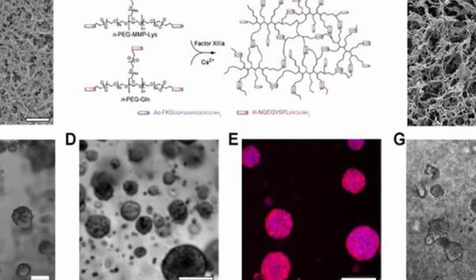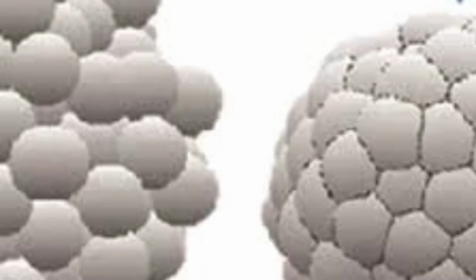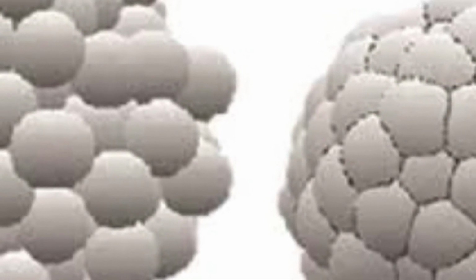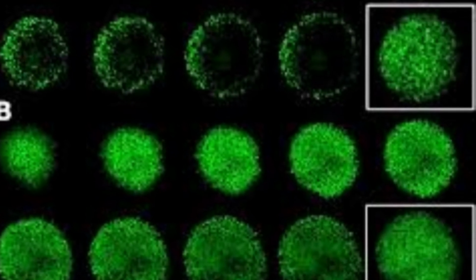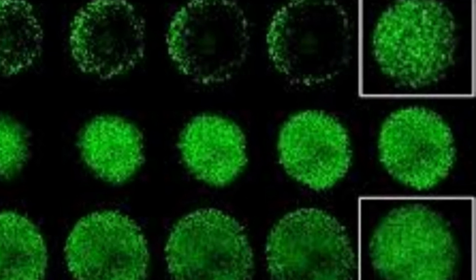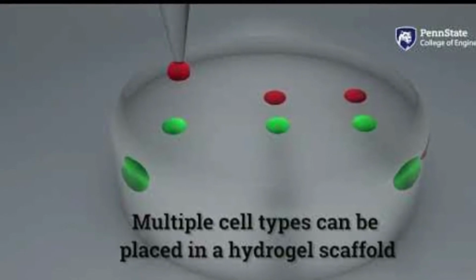Aspiration-assisted bioprinting uses the power of suction to move tiny microscopic spheroids. Just as one could pick up a pea by placing a drinking straw on it and sucking through the straw, aspiration-assisted bioprinting picks up the tissue spheroid, holds the suction on the spheroid until it is placed in exactly the proper location, and then releases it. The researchers report on their tissue engineering work today in Science Advances.